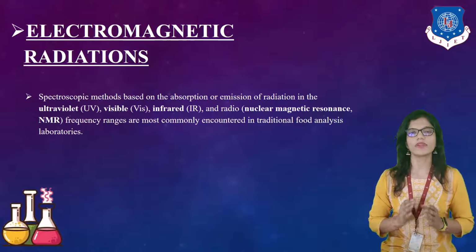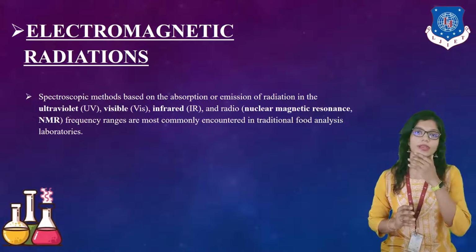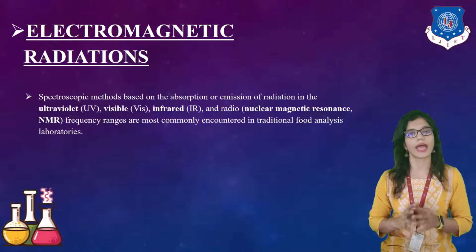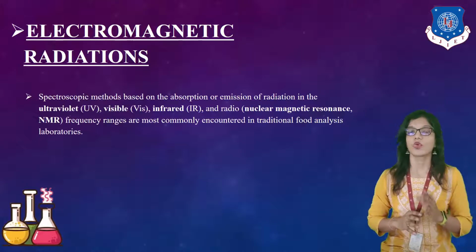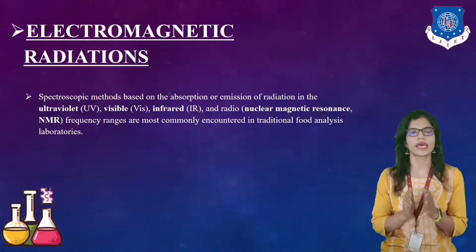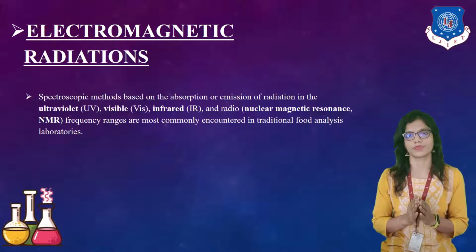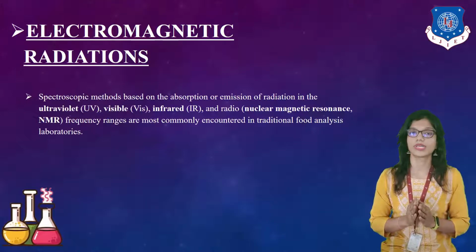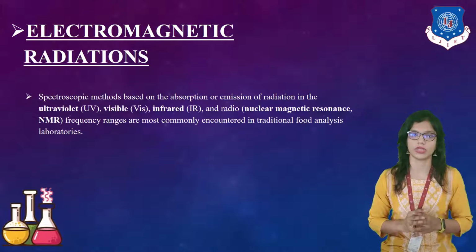Till now, we have seen potentiometric titration, conductometric titration, and what pH metry is. These are used on a primary basis, or I should say in preliminary examination.